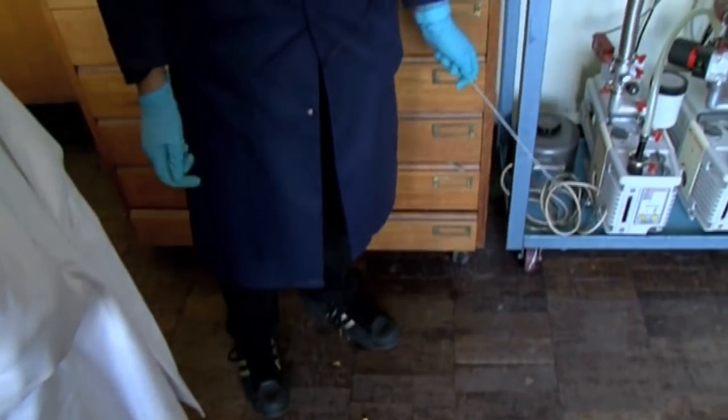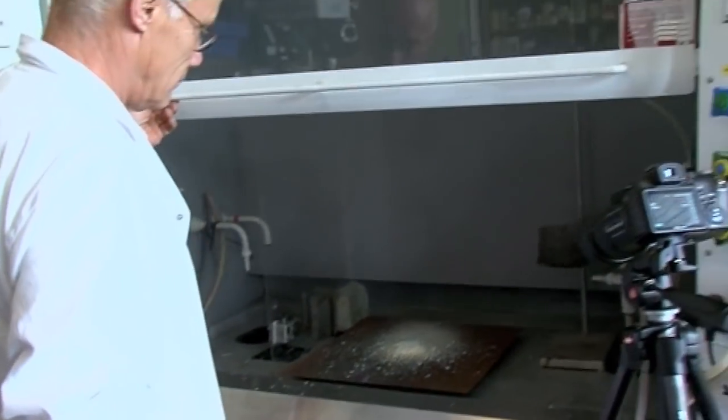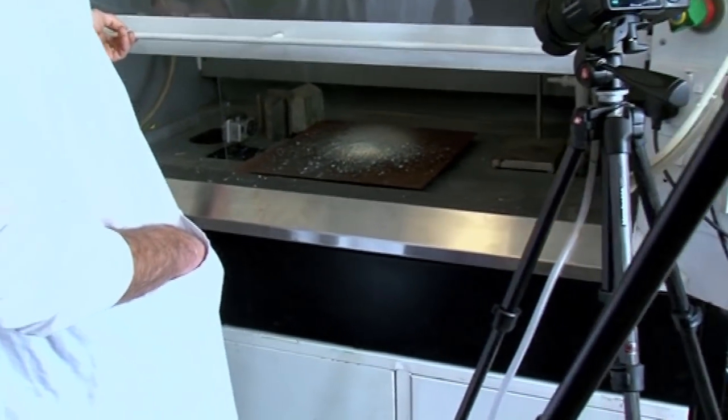I liked how it actually bounced off my lab coat — it's a good job I was wearing my safety gear, otherwise we would have been in trouble. And the stuff that's left is zinc sulfide. This is a very simple reaction: zinc and sulfur giving you zinc sulfide. That's the white powder that you're seeing there.